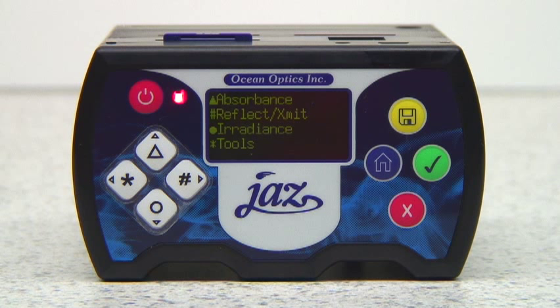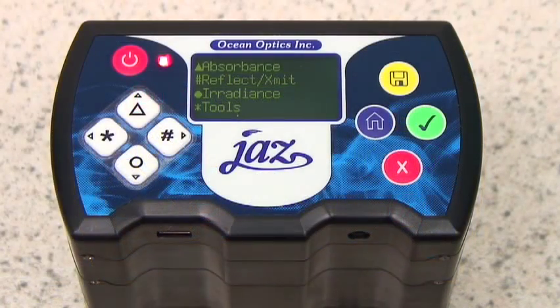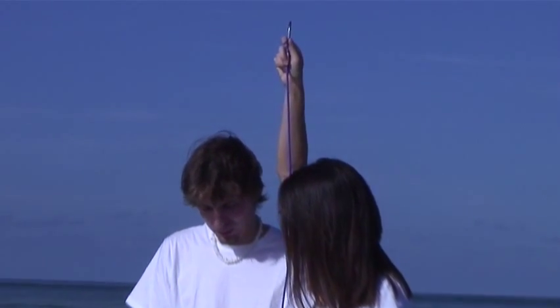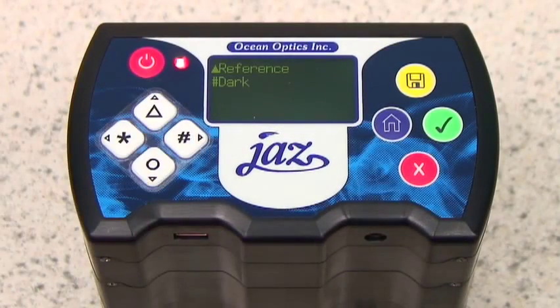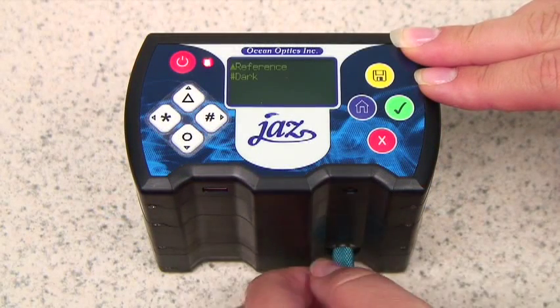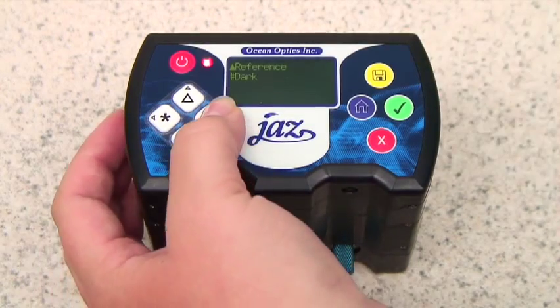To take an absorbance, reflectance, or irradiance measurement, press the corresponding button and you should see a screen with the option of reference. Point your JAZZ to an external light source or connect it to a light source in order to capture your reference. Once in position, hit the triangle button to store. You should now see a screen with a choice between reference and dark. Since we already have the reference, we want to store the dark. Do this by screwing the cap back on the spectrometer or blocking the light source. When in position, press the pound button to store.